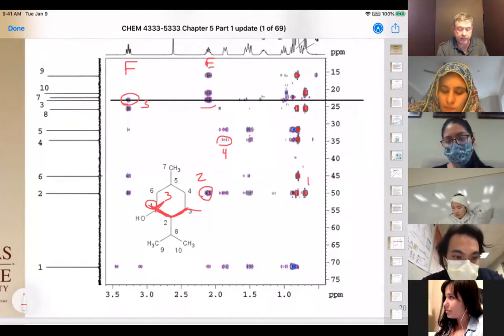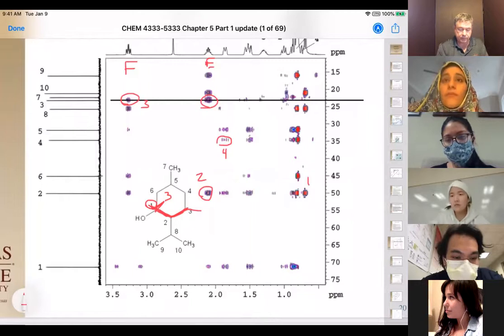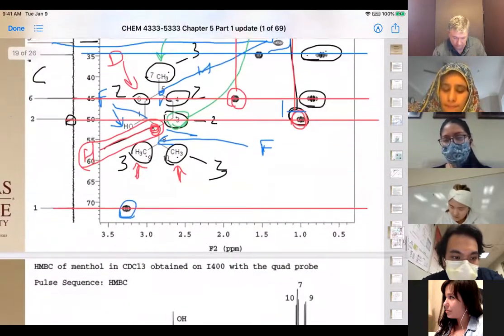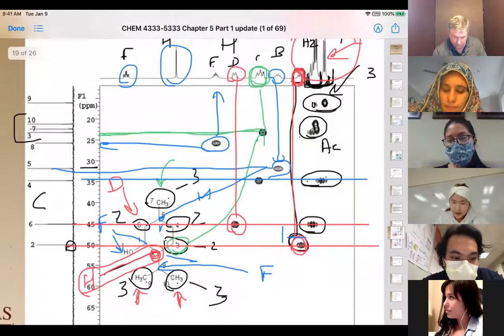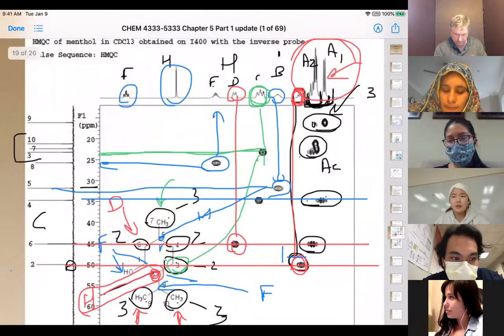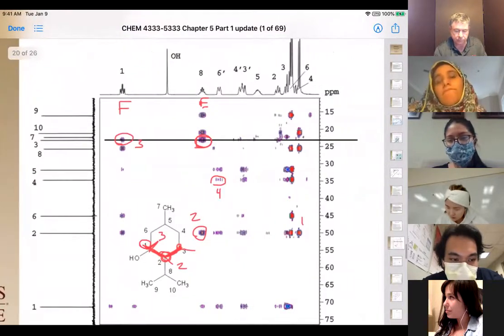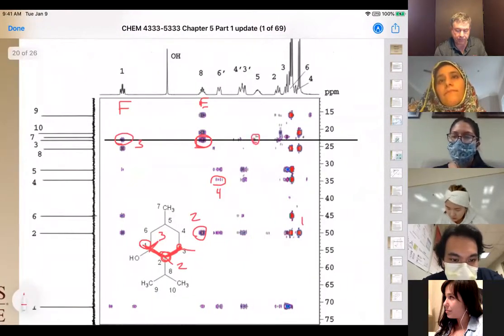Okay, so E right here is this number 2. So it's a carbon over 1. So that's a 2 bond connection. And notice how it's more intense right here. And then the carbon that was attached to these hydrogens that are attached to 3, which are C, which is this 5 here. Notice it goes away. So this is where they were attached the first time.